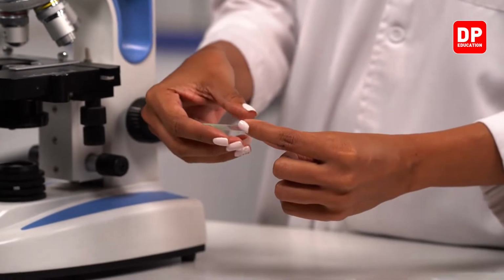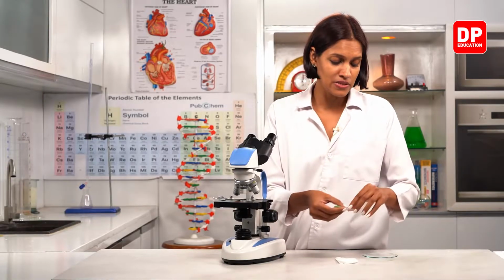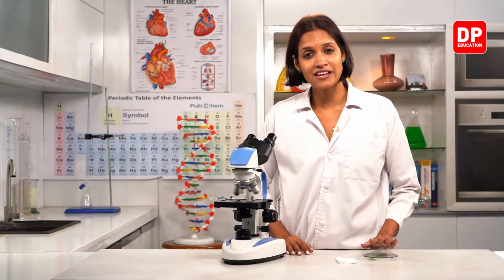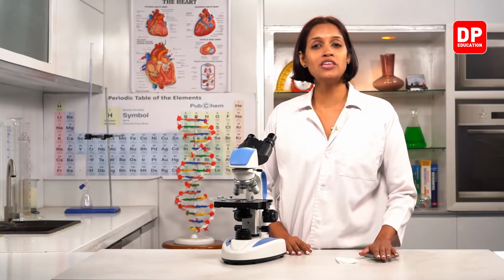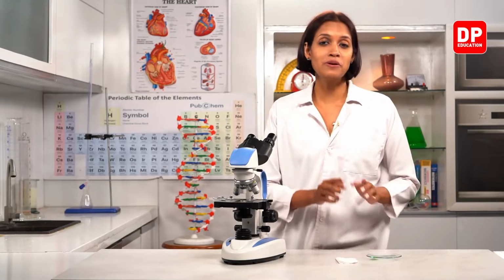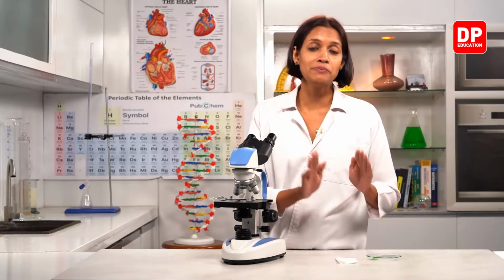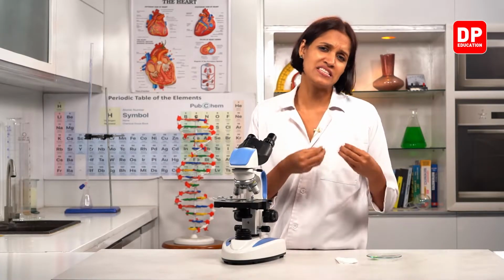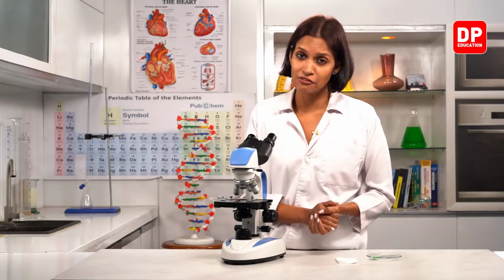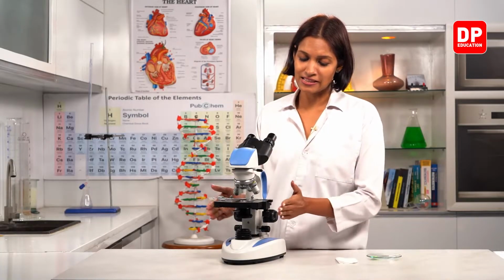Right, children? So remember, whenever we use these slides and cover slips, we have to make sure they are all clean. Not only that, when we place this slide prepared by us on the stage, we have to first of all wipe it off. If there is any water or other liquids, we need to wipe off the excess liquid from the slide. Okay, children? That is the other thing.